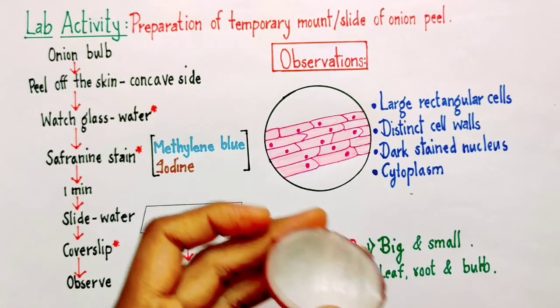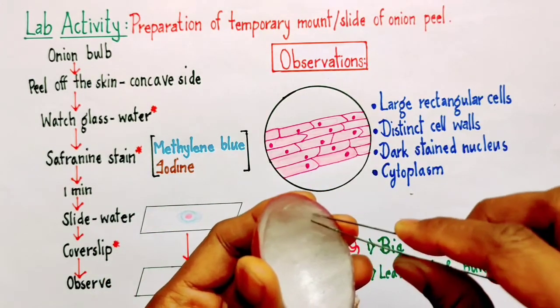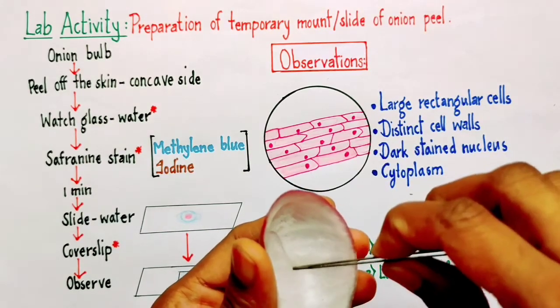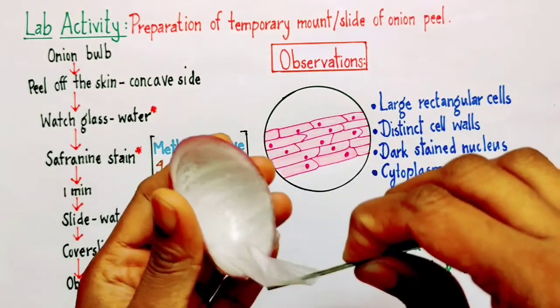Now with the help of forceps, we need to carefully peel out the inner skin. This is how it comes out.